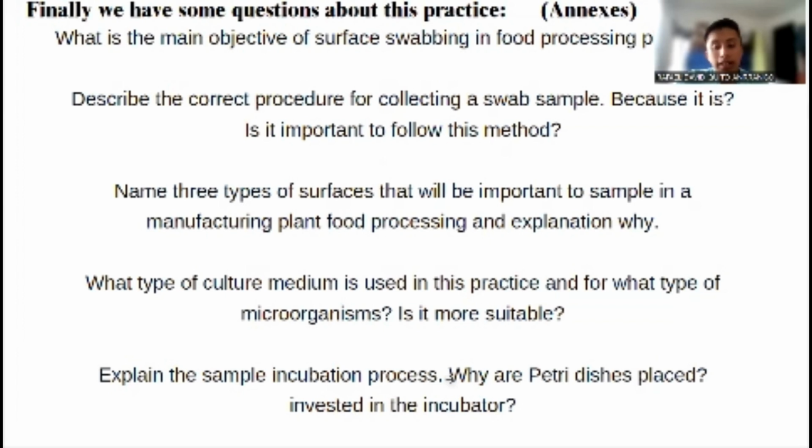After selection, the sample is collected using sterile gloves. The moist swab must be removed on the surface to be sampled, and contact with other surfaces must be avoided due to cross-contamination. Finally, the sample is transferred to the culture medium of growth from the laboratory, with labeling and storage with relevant information, for example, the location and the time.